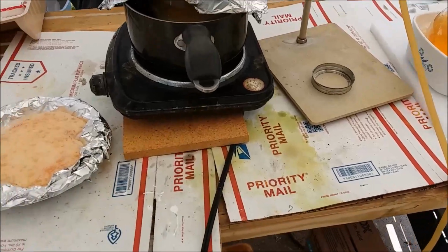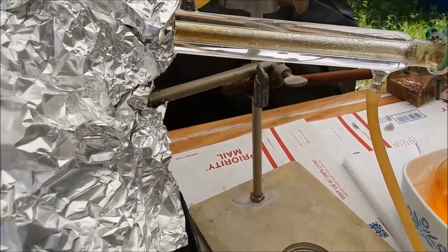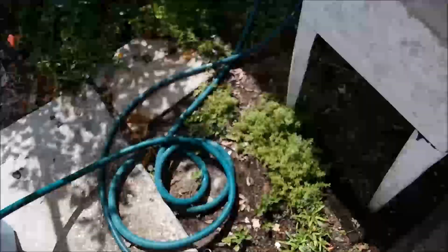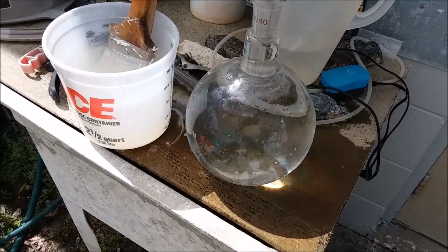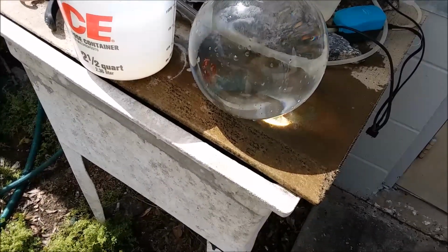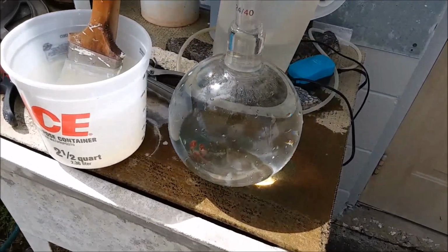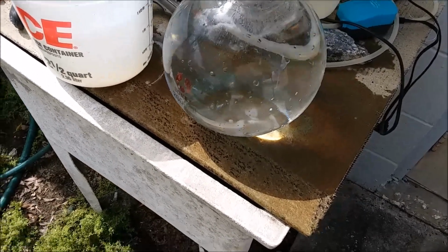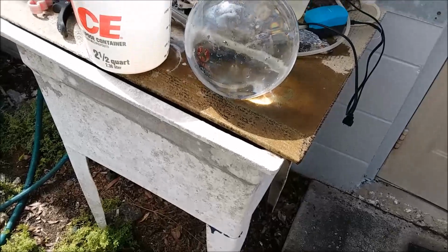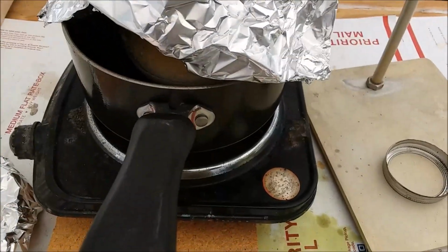Okay, the second reaction is well along. Getting some good condensation over here. I took the 2 liter boiling flask, set it over here, and I filled it to the top with hot water. Not quite boiling hot water, and I'll tell you what, almost all of the sodium bisulfate that was in there has dissolved already. It's only been a couple minutes. So dumping it out while it's still semi-liquid really made a big difference in the cleanup time. So that was fantastic. So I'll do the same thing with this one when it's done.